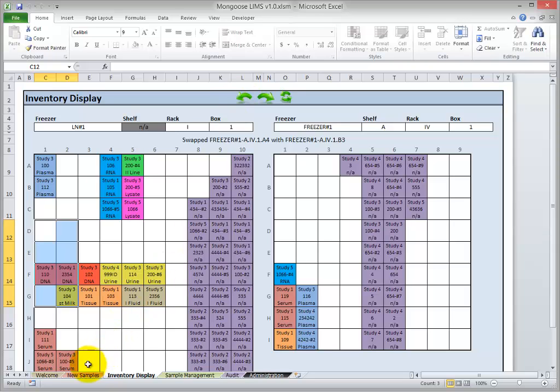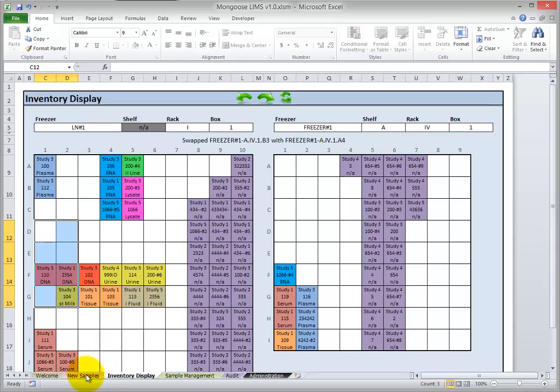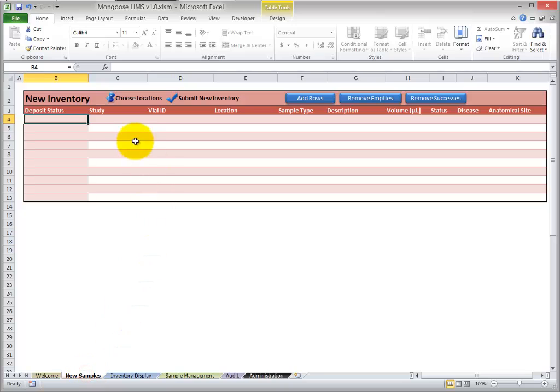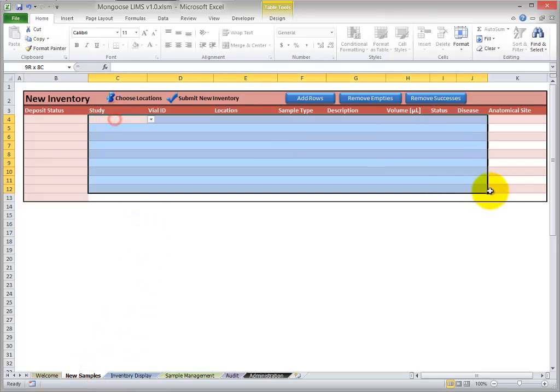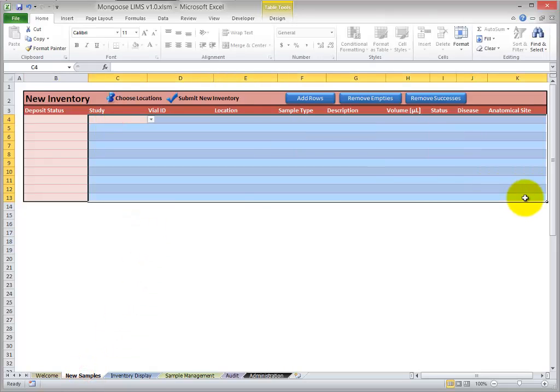Let's move over to the New Samples module. So all you do is place information for the new samples here and click Submit.